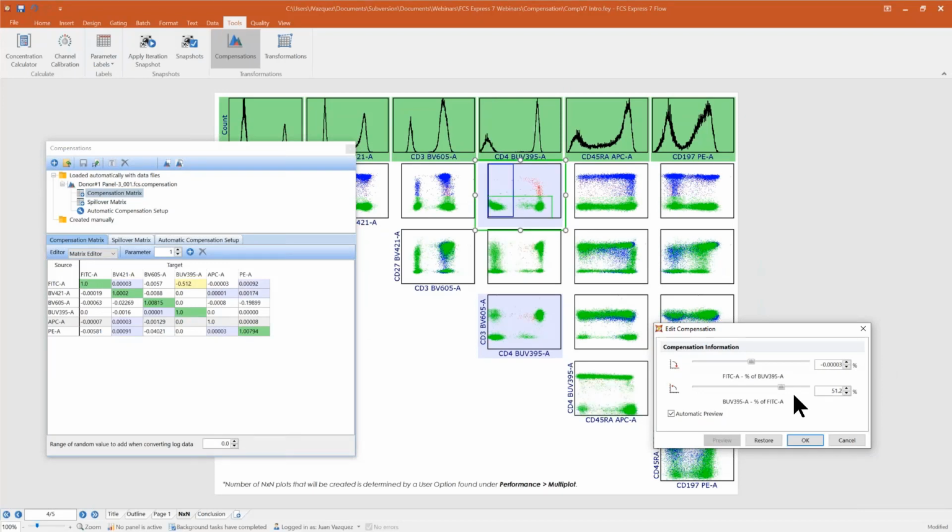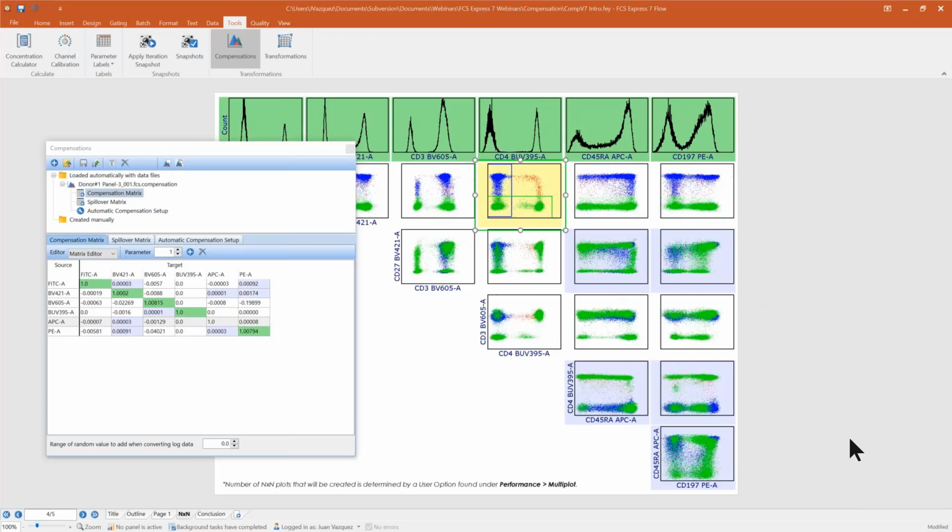Any change in my color, you're automatically going to see within the plots, and it will match up with whatever the matrix values are as well. Okay, so again, this is a great tool to help you QC your data visually and to provide you more peace of mind for whatever workflow you've established for your data analysis.